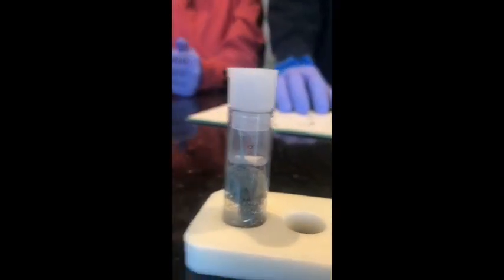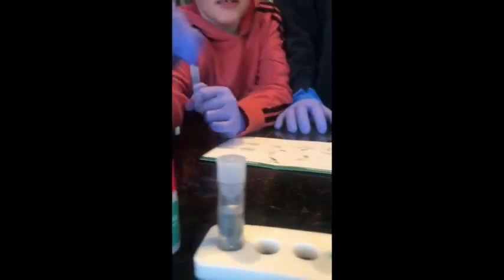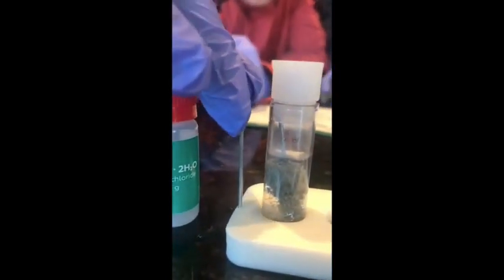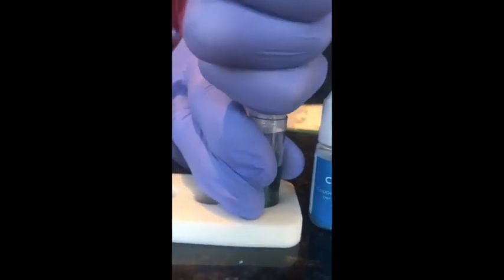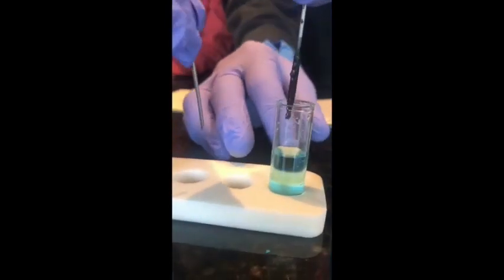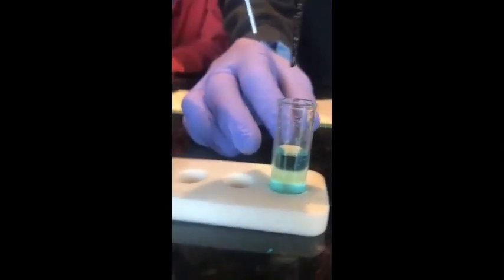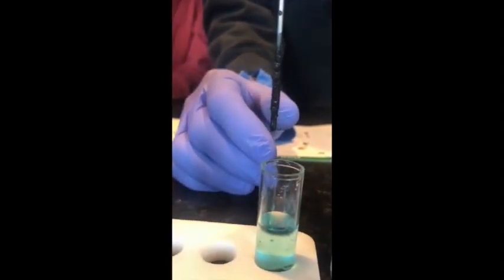So I took a picture. Duncan's going to hold up the zinc to show us what we originally had before we started, and I'm going to just gently pull up the first piece of zinc to show you the end product. Can you pull yours up here? Thank you. And that is what we are left with at the end. Don't touch it though, please. Okay. So that's the first one.